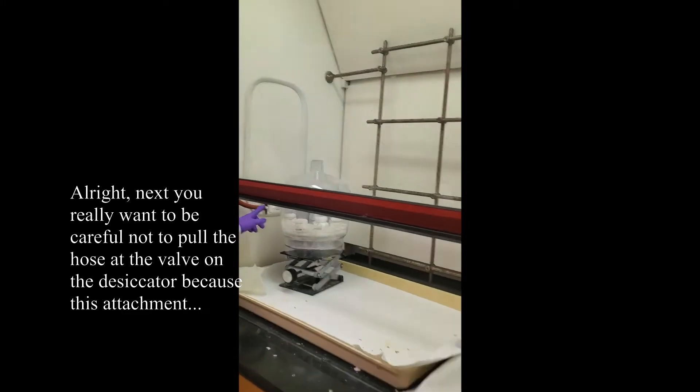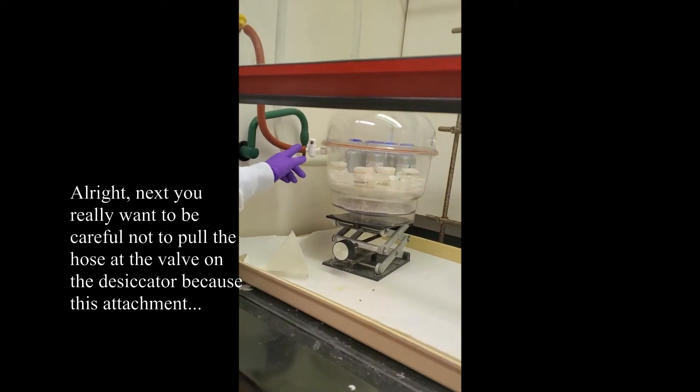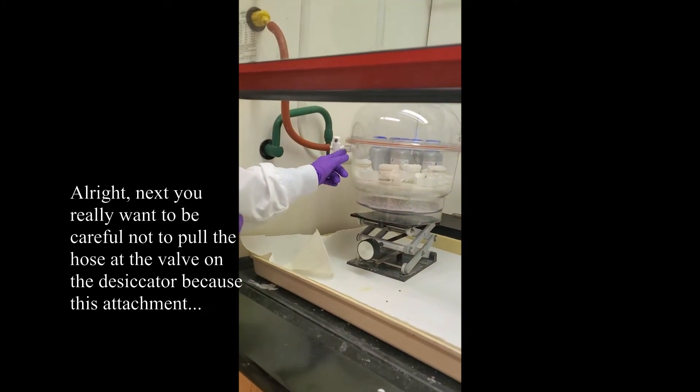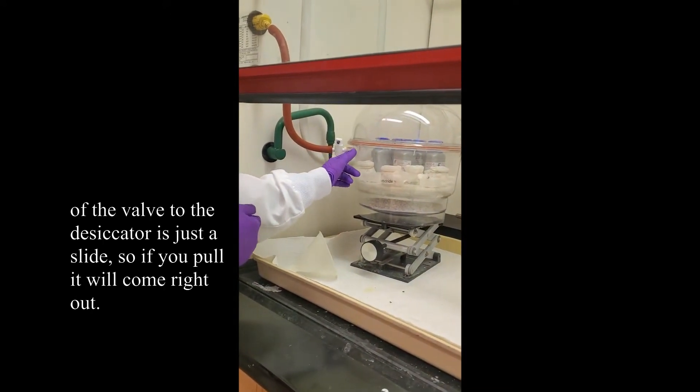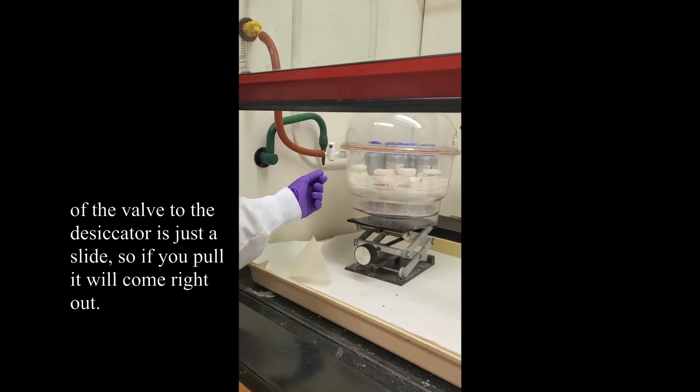Next, you really want to be careful not to pull the hose at the valve on the desiccator because this attachment of the valve to the desiccator is just a slide. So if you pull, it will come right out.